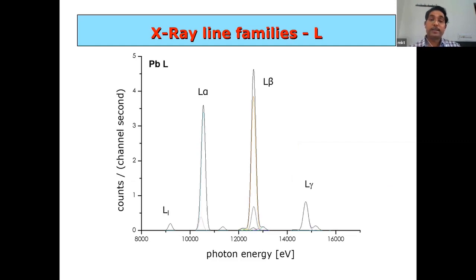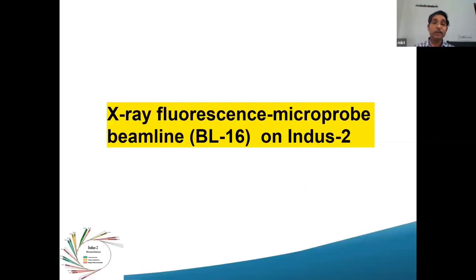Similarly, the L shell structure is again very complex. So again, it is very complicated, especially for quantitative analysis. So now I'm coming to the experimental beamline. So you see, this is what we have.